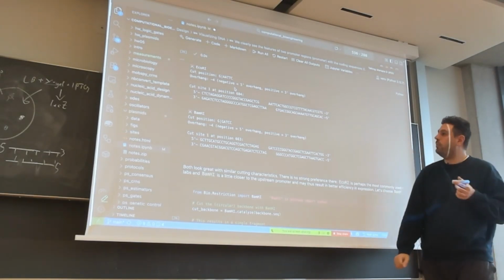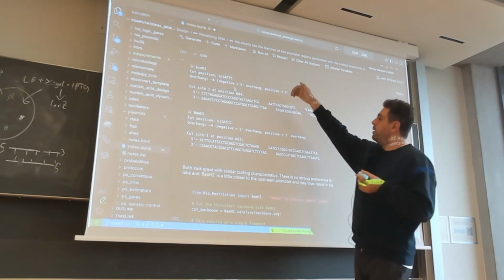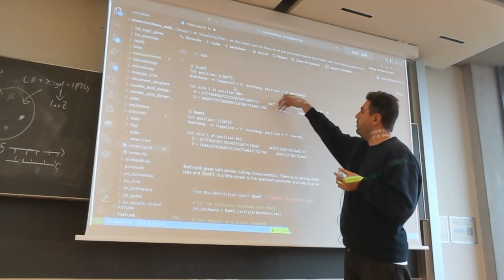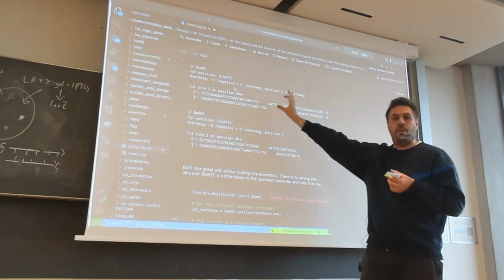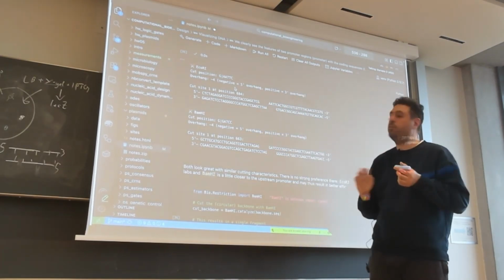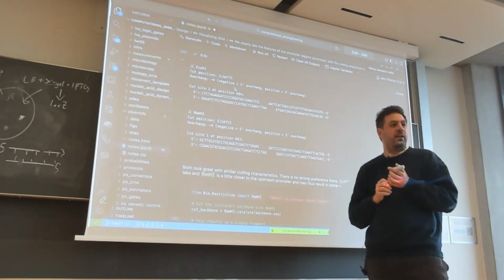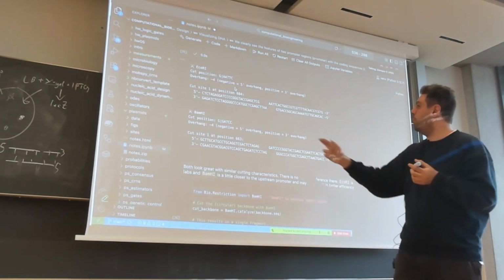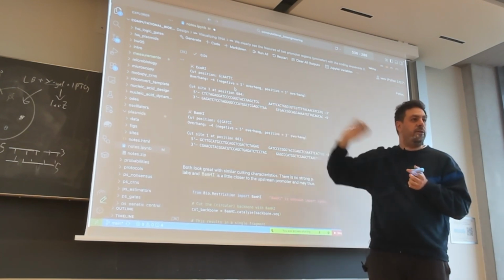By the way, is this a problem? I told you we should linearize, and then we have to make this homology for the Gibson cloning here and here, right, with our insert. The homology should be 20. Is this a problem that it's not blunt here? Any ideas? Also online viewers? Is it a problem that we have an overhang here, that we are not clean cutting here?